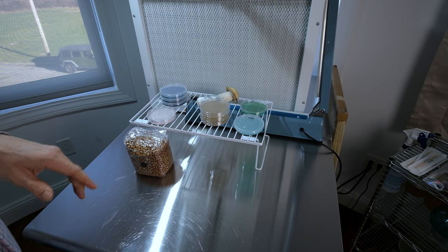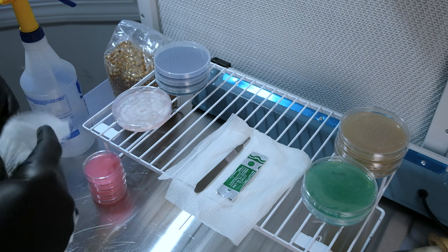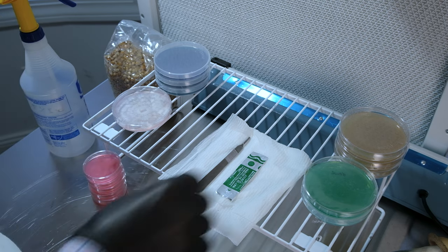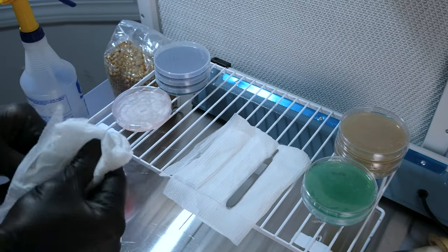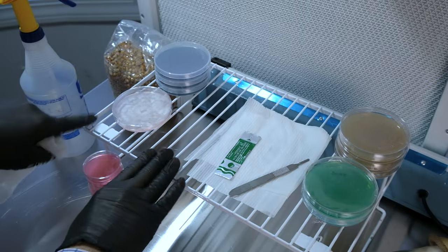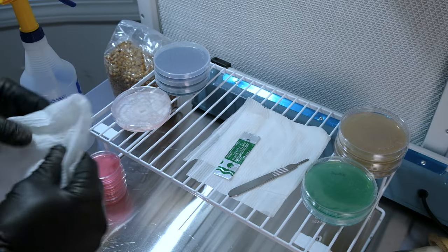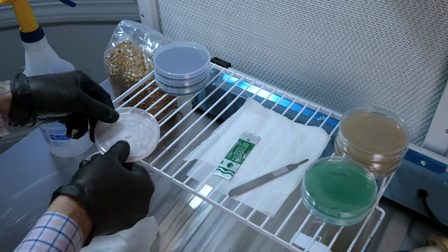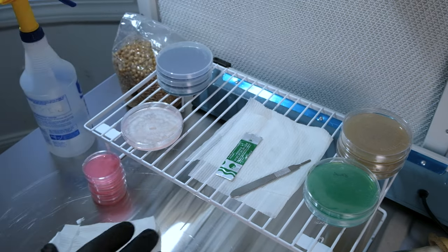We're going to do our first culture transfer. I've got a culture I'm going to expand to a couple of plates. First, wipe down the scalpel really well and wipe down the blade package. I like to keep an alcohol-soaked rag on my workspace. This rack lifts everything up into the sterile airflow — you want to work in the middle of the airflow, not down low, to increase your chances of success. We'll make three plates with this culture and then inoculate the grain bag.